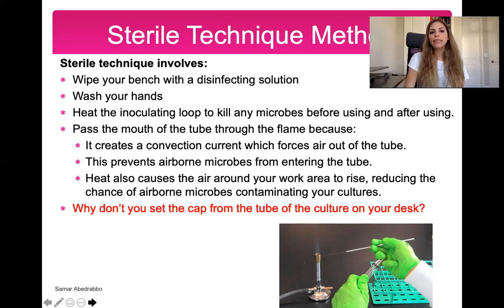So to transfer bacteria, we use something called an inoculating loop. Here's a little image of it. So this person is holding the inoculating loop. And before you grab any bacteria, you always want to heat sterilize it. So anytime we're working with anything in lab, we want to pass it through the flame if it won't break, so that we sterilize it, because heat kills most microbes.